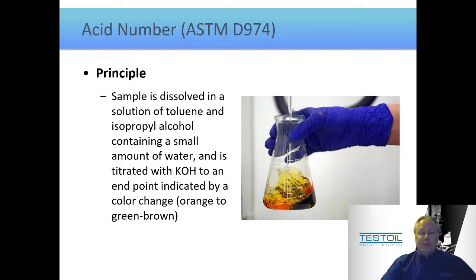So what we do is we treat your sample as if it was an acid and we add base to it. By counting how much base we put in, we can determine how much acid was present. So like I said, very much a simple basic chemistry type reaction.